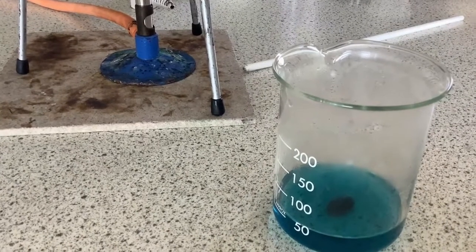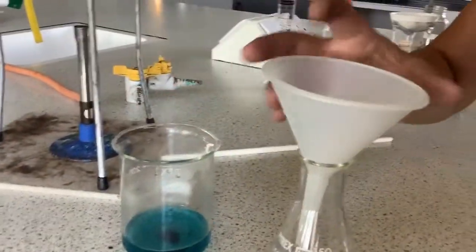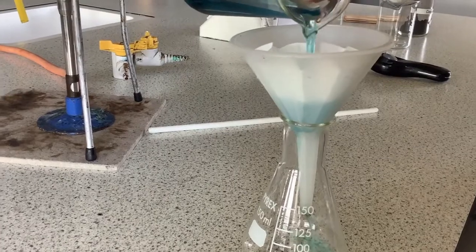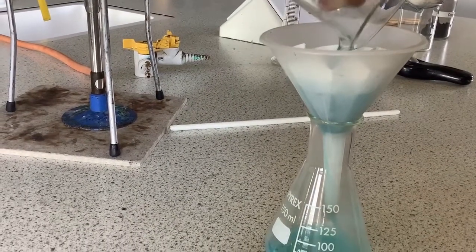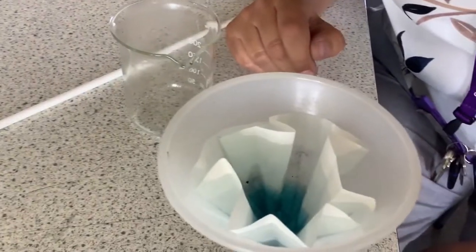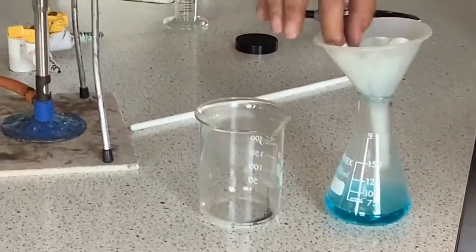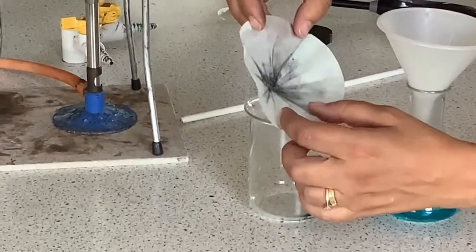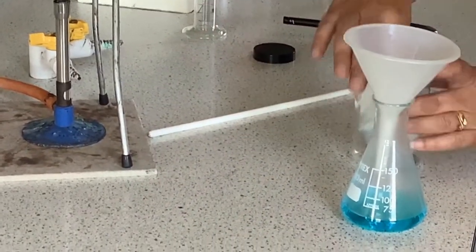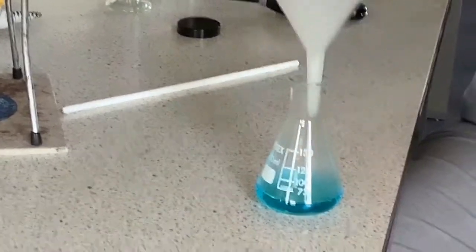We now need to remove this excess and we do this by filtering using a filter paper and a funnel. We can see that we now have a blue copper sulphate solution, and on our filter paper we still have the black copper oxide that was in excess. In this kind of experiment we always add the solid in excess because it's easy to remove by filtration. If we'd added the liquid in excess then separating two liquids becomes more complicated.